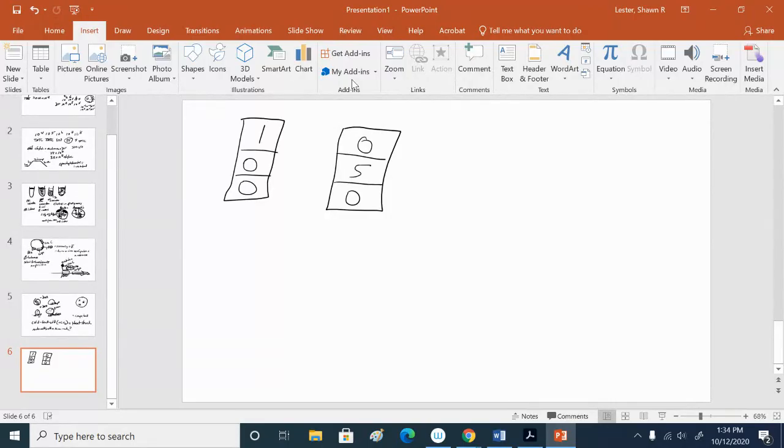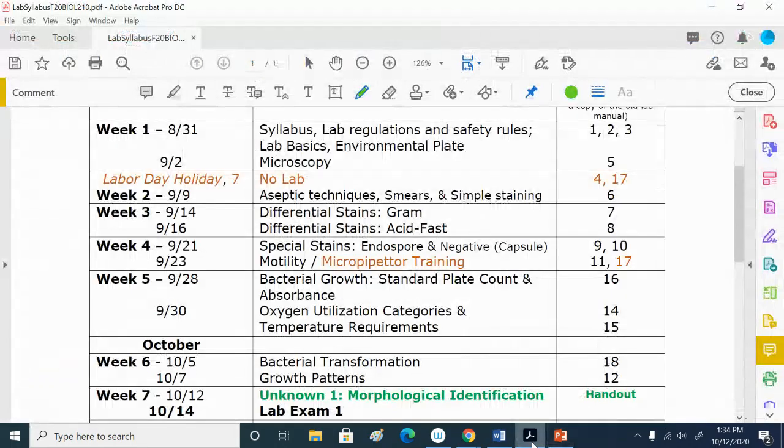Right, 5 microliters. If this is the 10 to 100 microliter pipetter, what's it set for? 50. And the 100 to 1000 microliter pipetter? 500, right? Yeah. So you need to know what the settings mean on the pipetter, right?